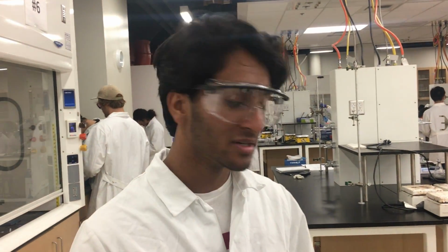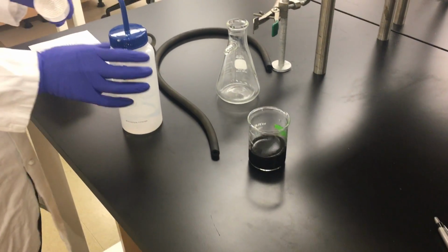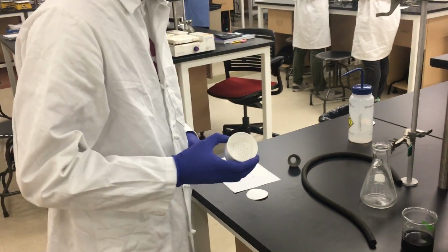My TA is Hal. Today we're going to be doing the filtration of a solution of water and activated carbon right there. Okay, so we're going to begin by assembling the funnel and the vacuum filtration system.